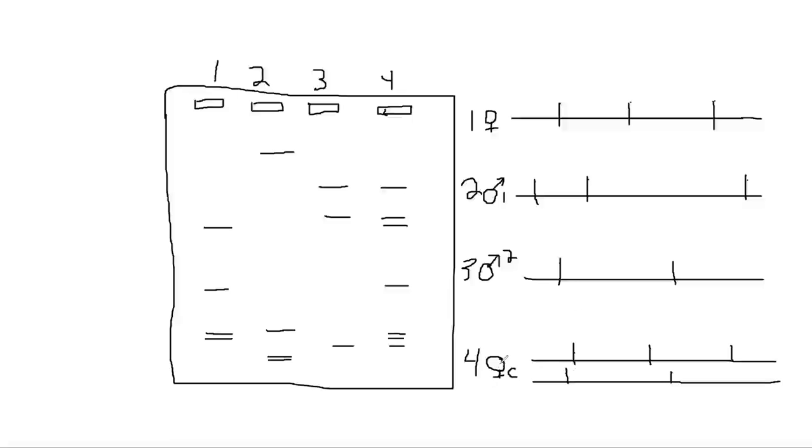And so we should see the lengths of fragments in the child match up fairly similarly to the lengths of DNA we cut up in their biological parents. To actually do this, let's look at the mother first. The mother has these 4 segments, and we can go over to sample 4 and say, okay, where do those segments appear in the offspring? And let's just cross them out.